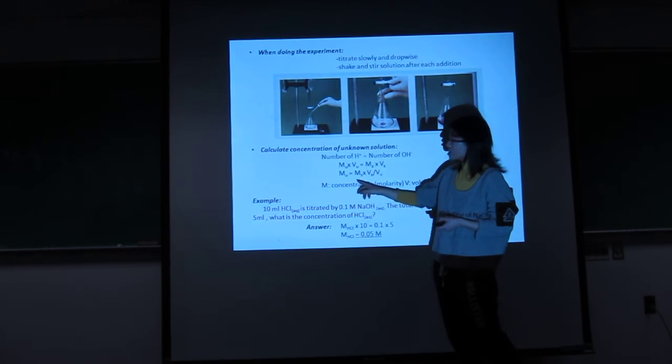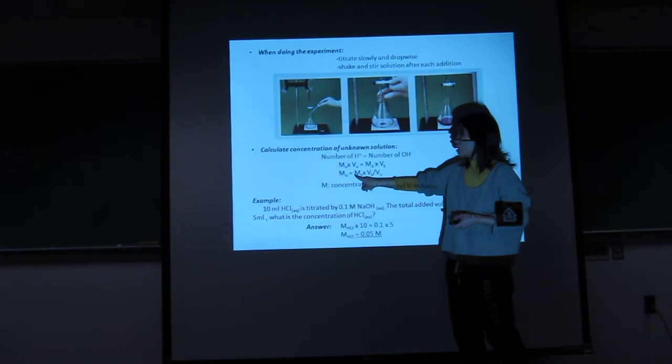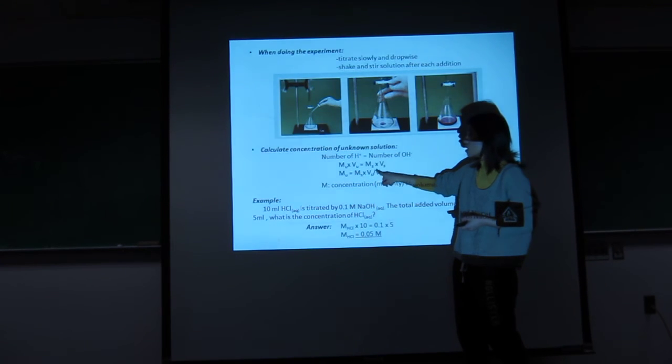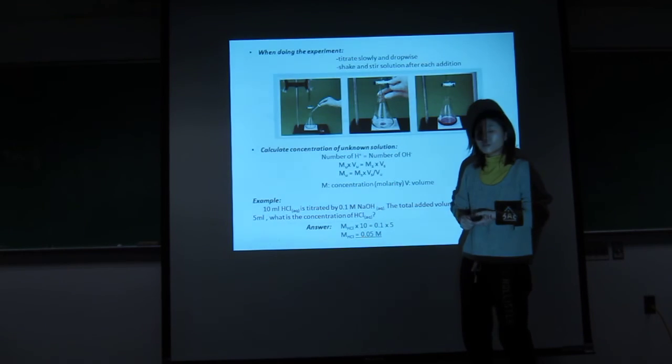So then you can calculate the concentration of your unknown sample, which is equal to the concentration of standardized solution times the volume of standardized solution over the volume of your unknown sample.